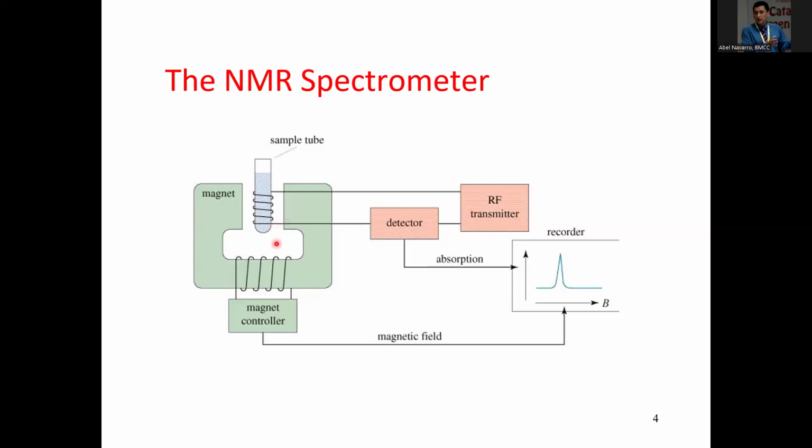Something else very important: NMR works in solution. There is also solid state NMR, but that's mostly to see how compounds behave in their crystal structure.